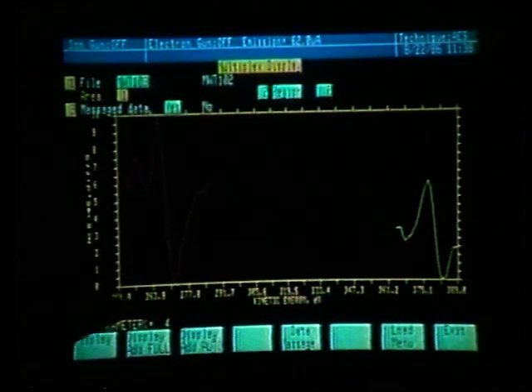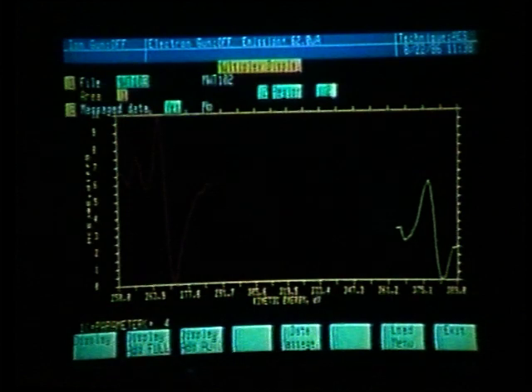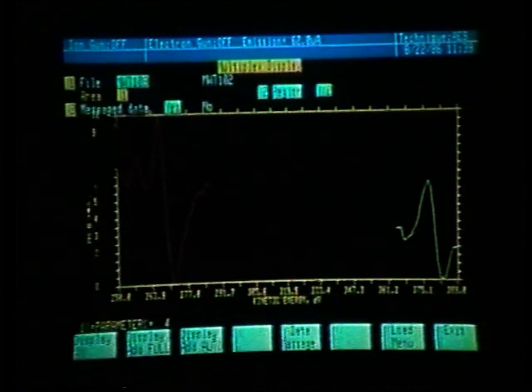Our previous graph showed carbon peak full scale and nitrogen peak full scale. With the display add auto, we now see the relation of carbon peak to the nitrogen peak. If you remember, in our multiplex, we did 10 sweeps on the carbon data and 3 sweeps on the nitrogen. 10 sweeps gave us much stronger signal than the 3 sweeps on nitrogen.